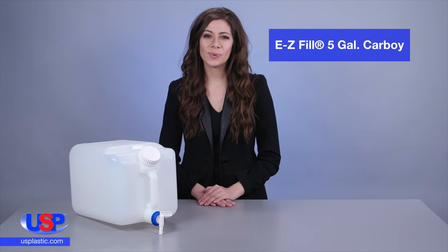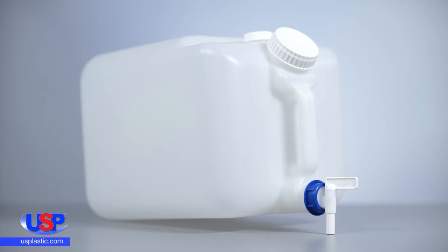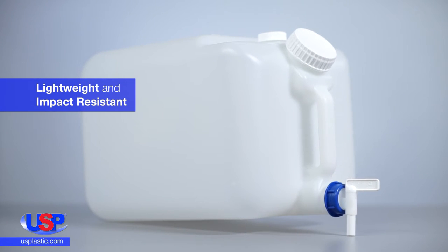At U.S. Plastic, we carry both square and rectangular carboys of all sizes and types. Made from high-density polyethylene, our easy-fill, 5-gallon carboy is both lightweight and impact-resistant.